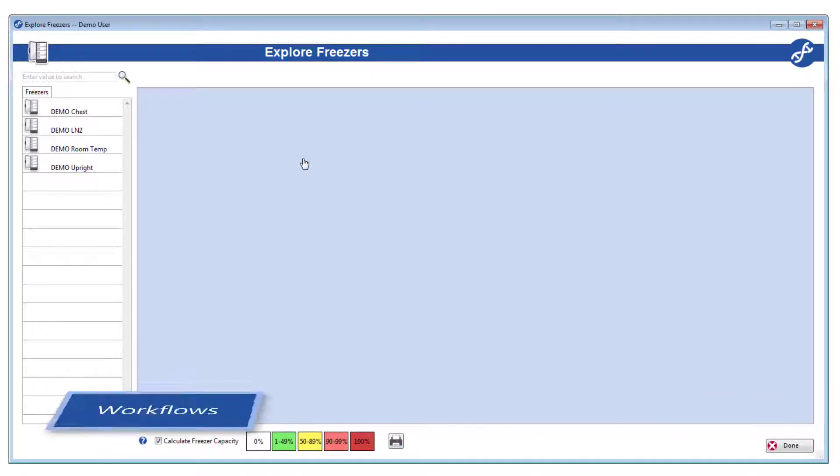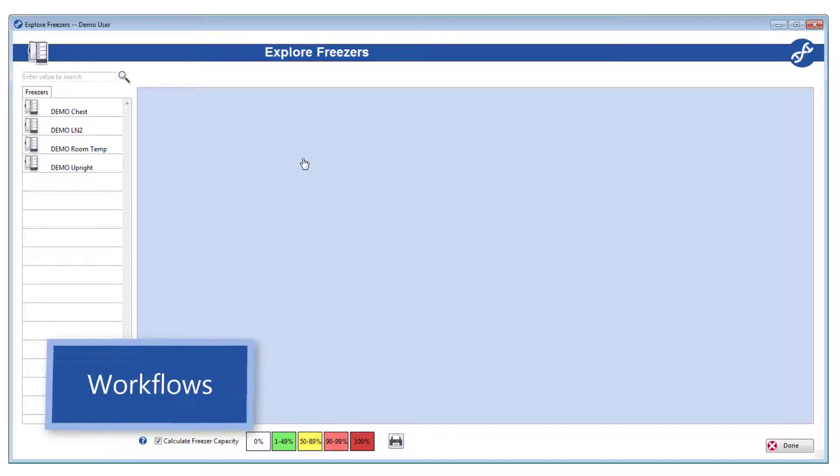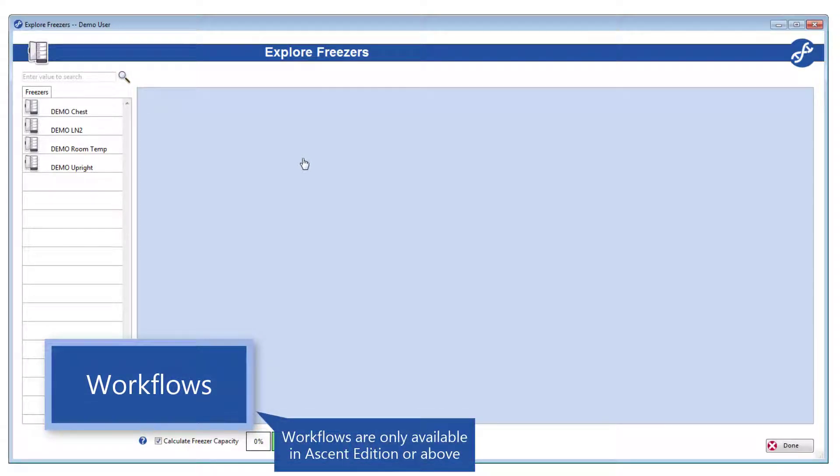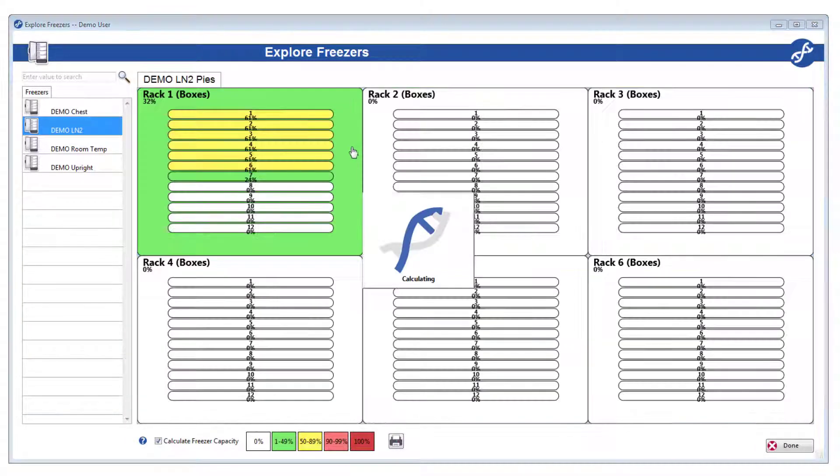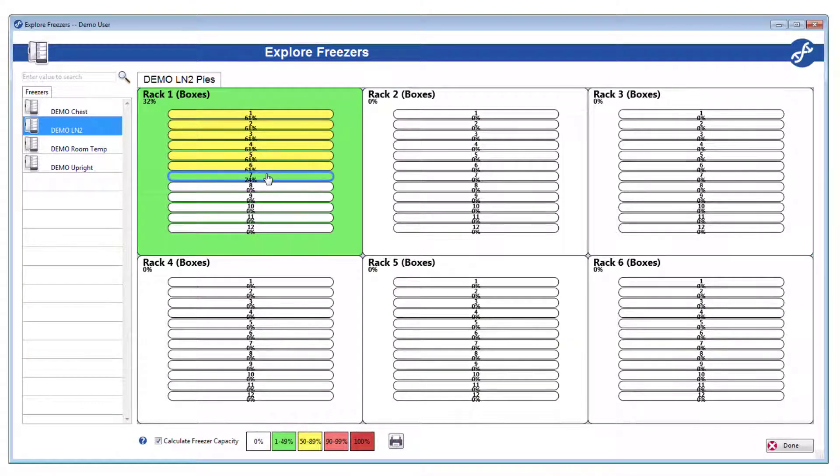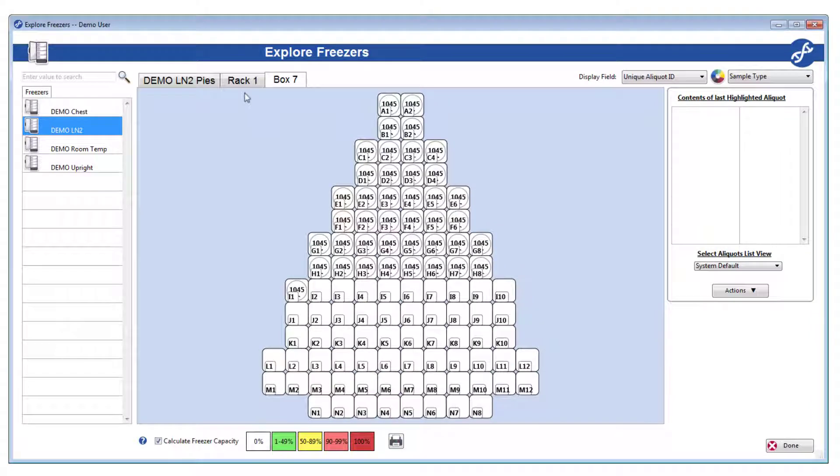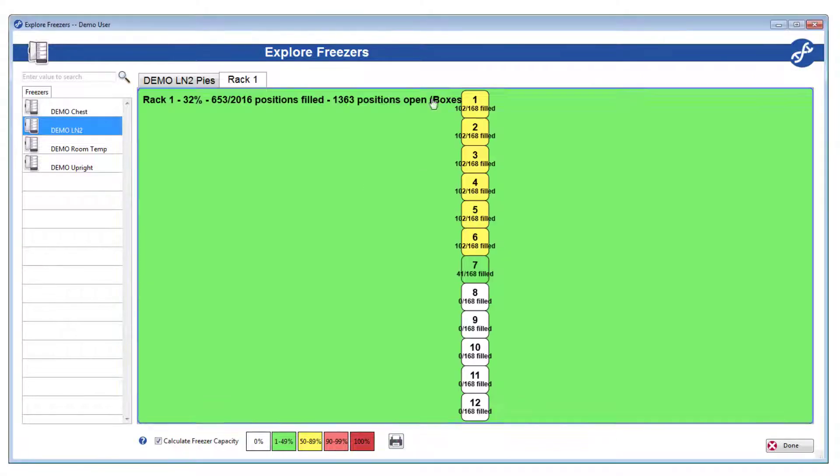For now, let's discuss one of the most powerful tools in Freezerworks, the Workflow, which allows you to perform a multitude of preset actions on a group of aliquots in one move. To see how this works, find some aliquots in Explore Freezers for example.